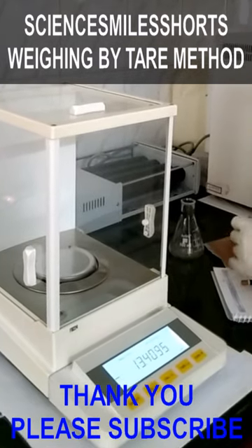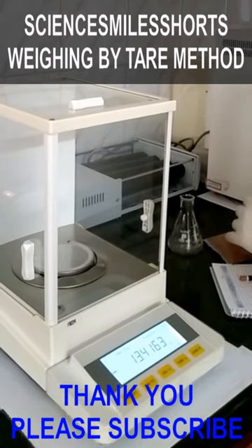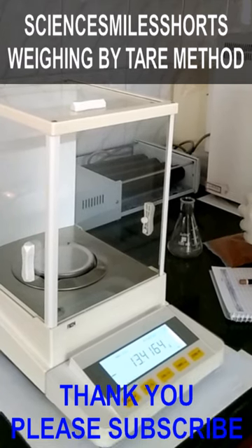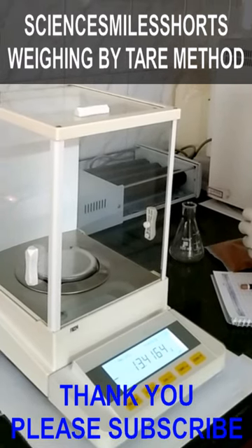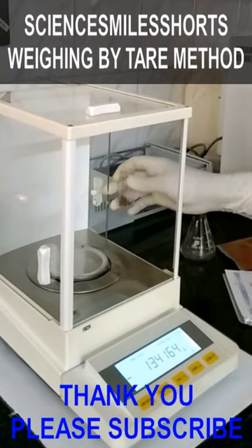The container is placed on the pan and the tare button is pressed, then it comes to zero. The material is then transferred into the container, which can directly be placed on the pan.